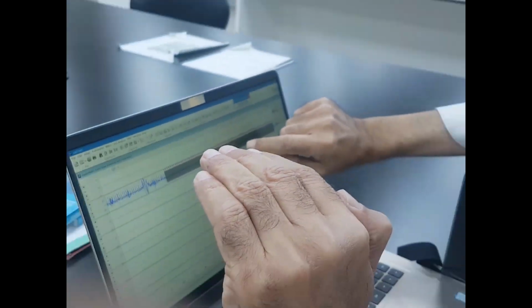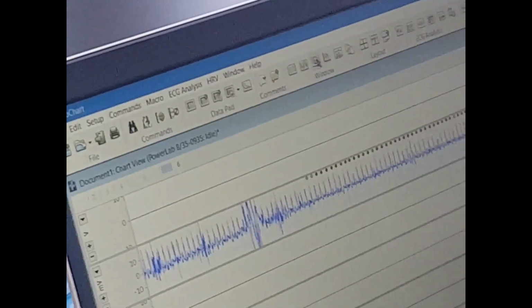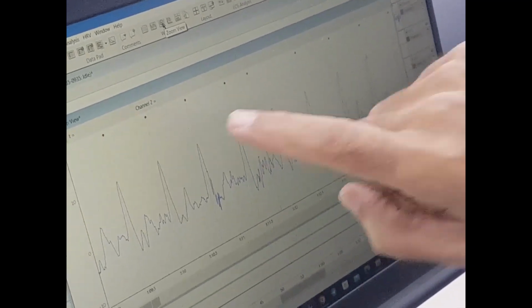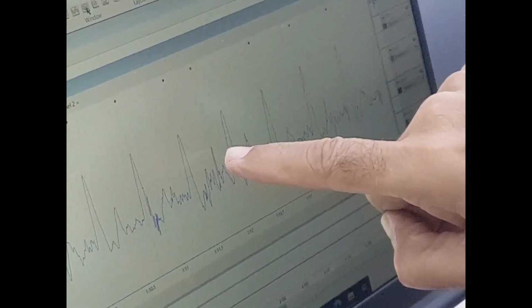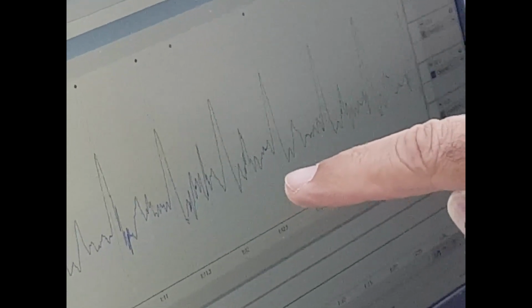You visually see we have reduced it to an extent where this is an artifact. Let us just see. We can zoom this area. See what is happening. So this is a zoom view. It is marking this one, this one, this one, and then this small one has also been marked. Means we have reduced the SD a bit too much, isn't it? But the rest of them are okay. Now how to overcome this problem?